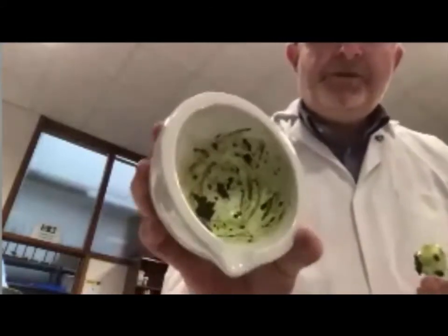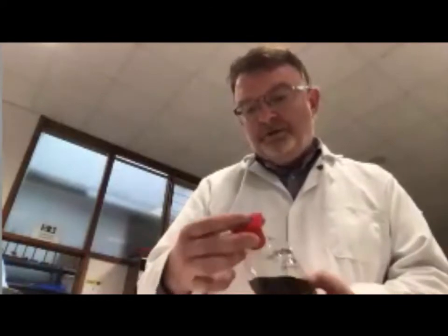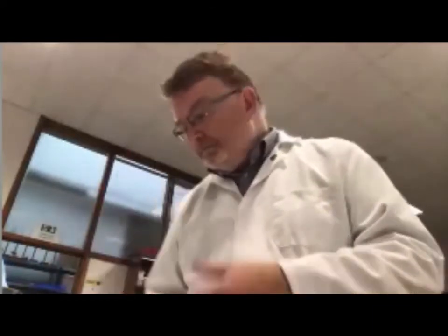mortar and pestle. If the pestle goes a greeny color like that, you've obviously got the pigment out of it. You then can use any solvent to get it. Usually alcohol is our go-to one. This happens to be isopropanol, which is what I have here. So that's grand. Then we have to use the Pasteur pipette as a dropper, but it's too wide. The other thing we need then is a hair dryer to dry our spot. So that's it.